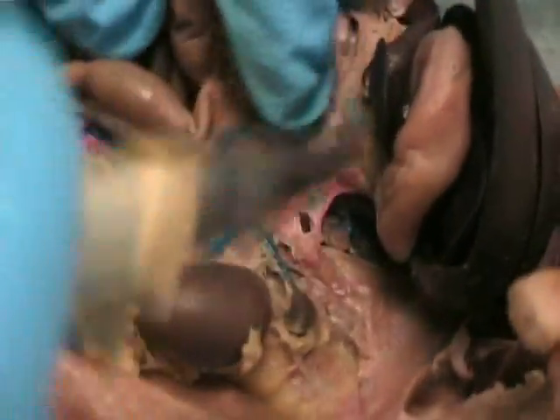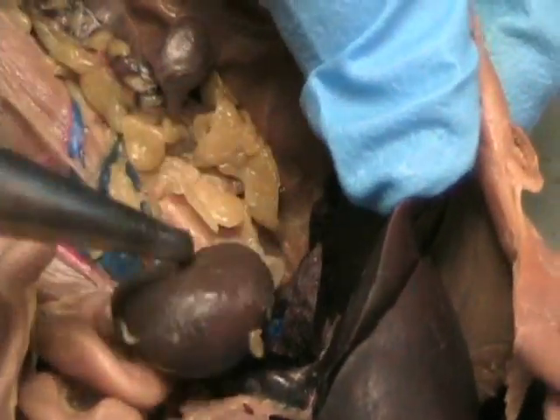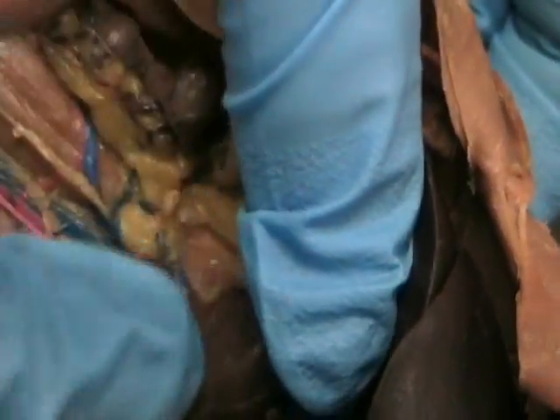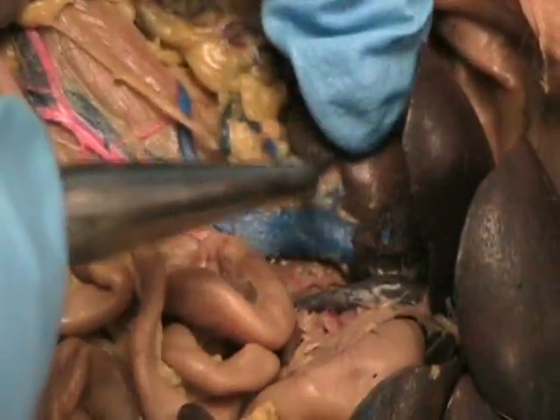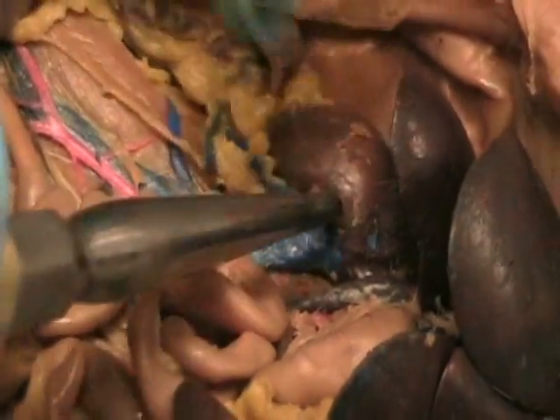Next, we're going to have one that's going to go to the right side, but it's kind of in between here, so I'm going to flip everything over. And it's going to come out here and go to this kidney. However, the veins are so big that to find the artery, I have to kind of turn it over. And then you can see the artery back there. But that would be the right renal. Okay? So you're going to have a right renal and then eventually you have a left renal.